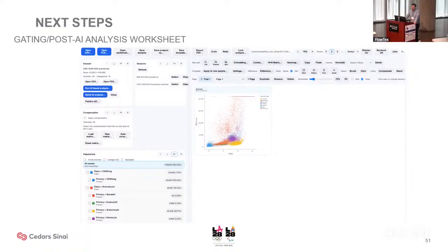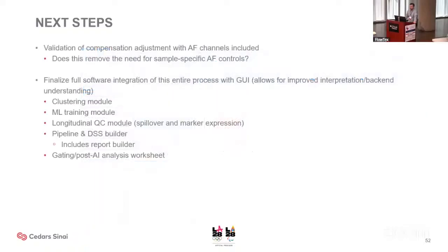full software where you can gate, you can do population hierarchies, you can add in TSNEs and UMAPs into this, you can do additional clustering steps on top of your samples, but you can gate everything by the actual machine learning classifications. You can view probabilities of all the cells on what their max probability was for every level of annotation. So you can start to see are some of these population, this is what I'll talk about here.